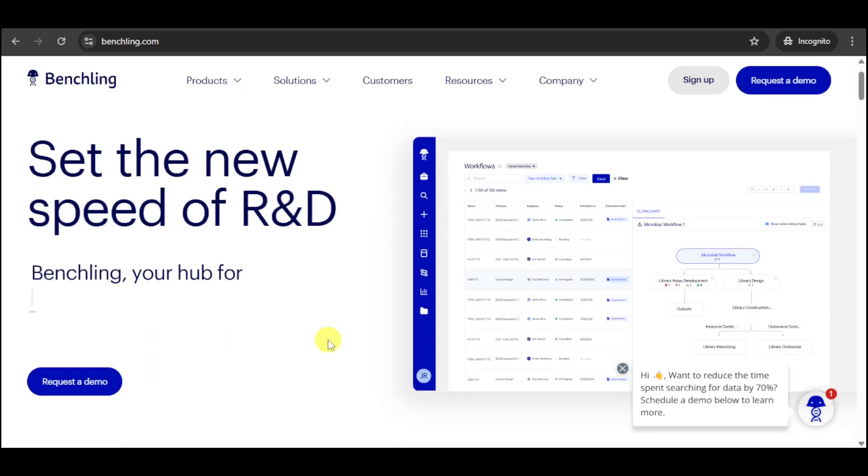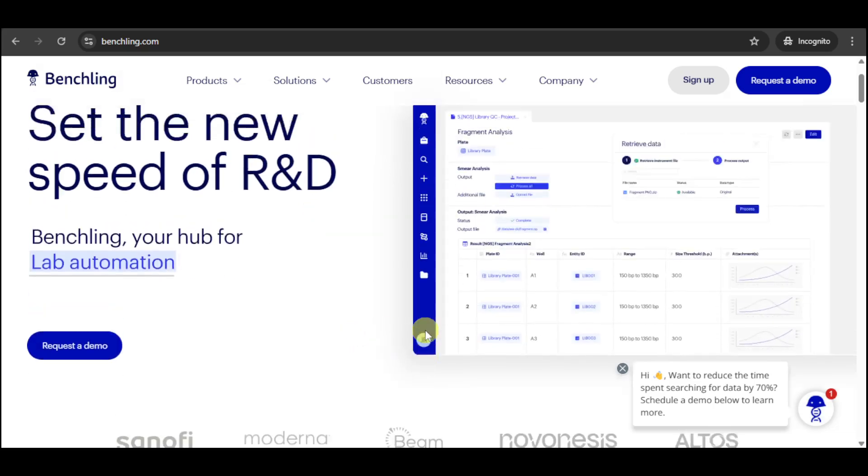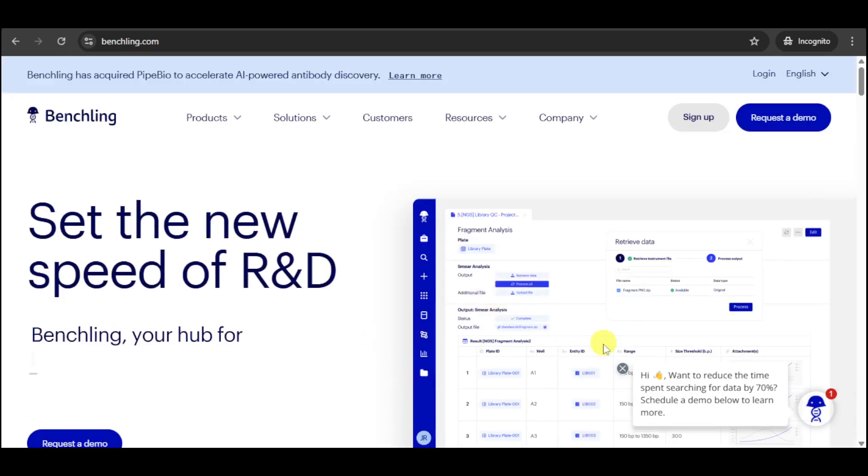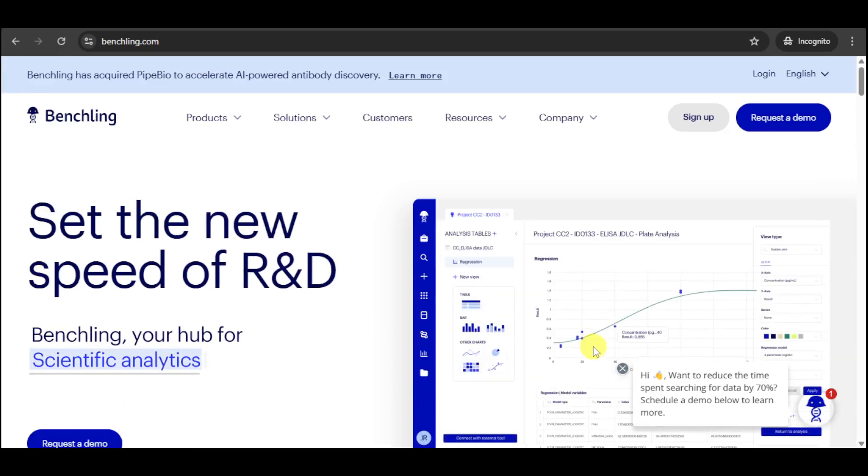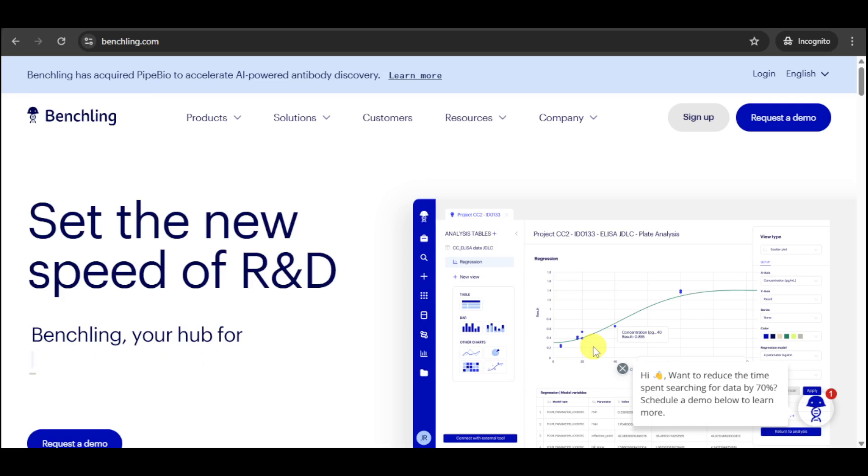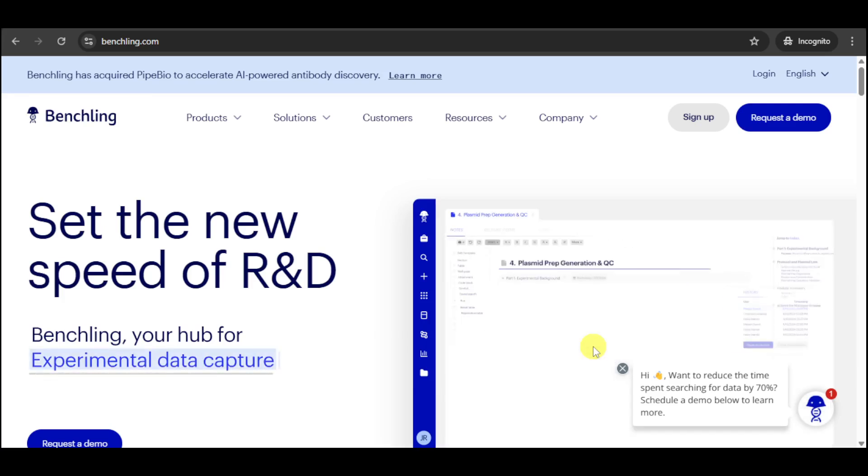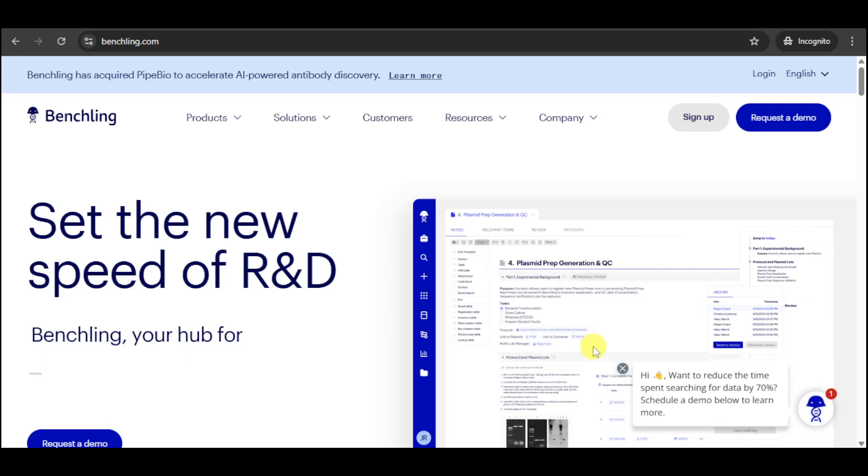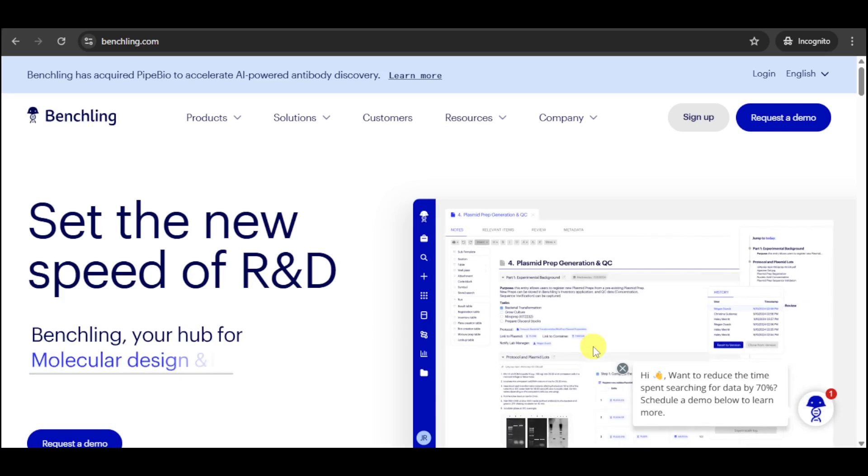Imagine seamlessly managing your experiments, tracking your samples, analyzing your data, and collaborating with your colleagues all in one place. With BenchLink, you can streamline your workflows, reduce errors, and accelerate the pace of discovery.